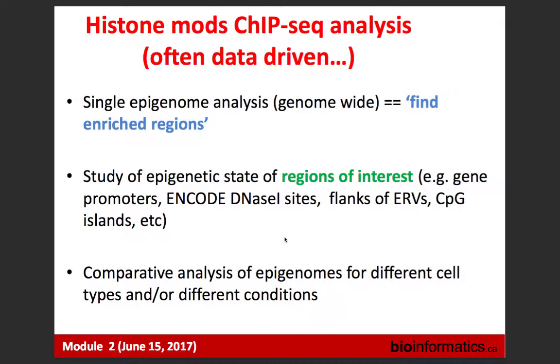Then we don't need to look at the entire genome. We just look at these regions, comparing those introns which have signal to those introns which don't. It's a little bit easier task, right? A little bit guided task. It could also be histone modification flanking some repeats, etc. This is the second scenario. So when we are not doing de novo, we already know where to look.